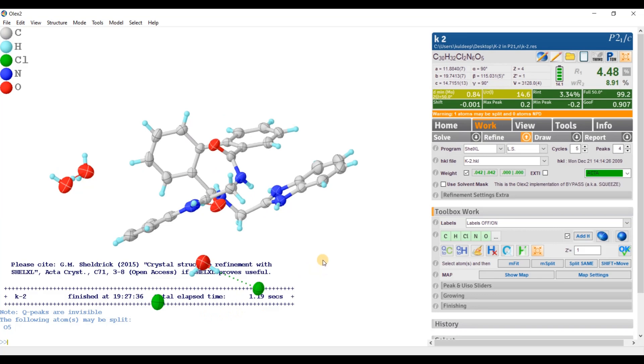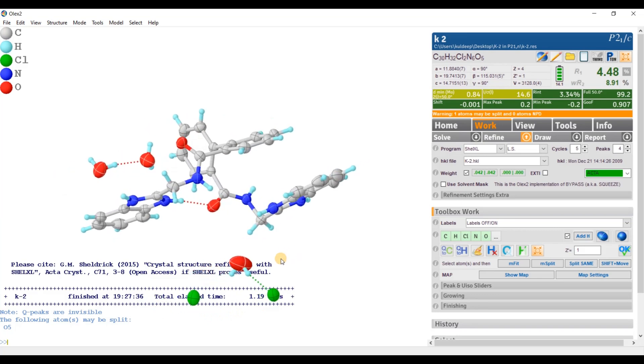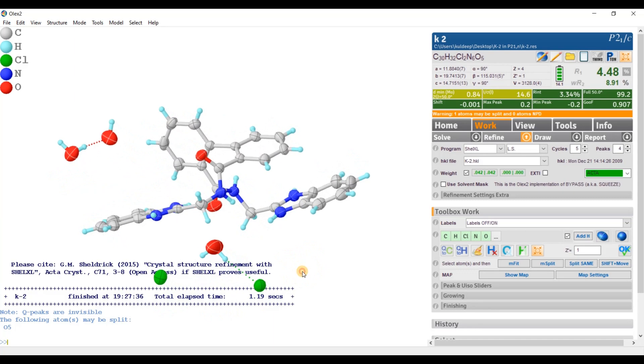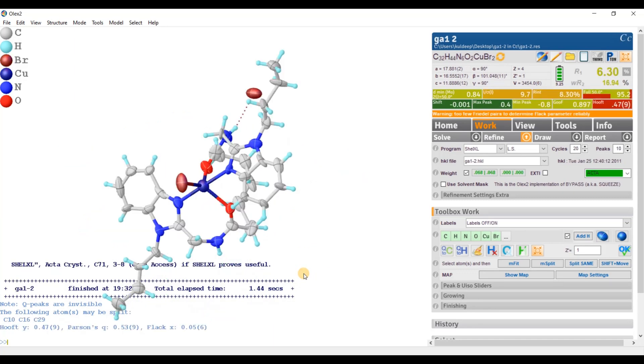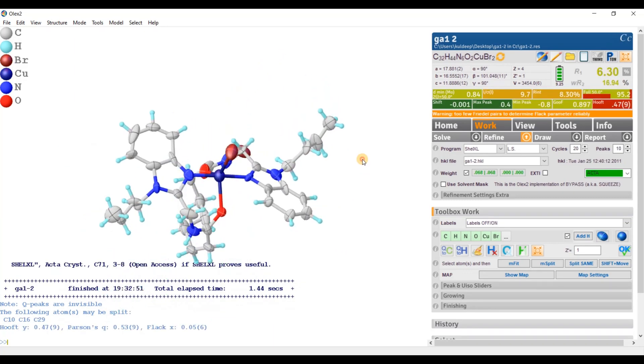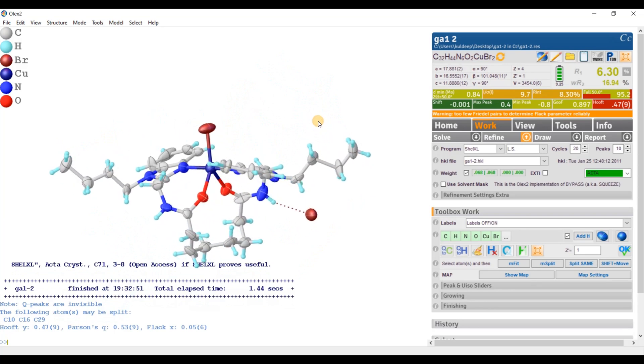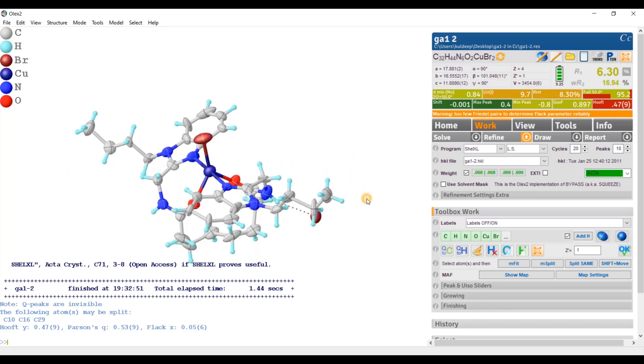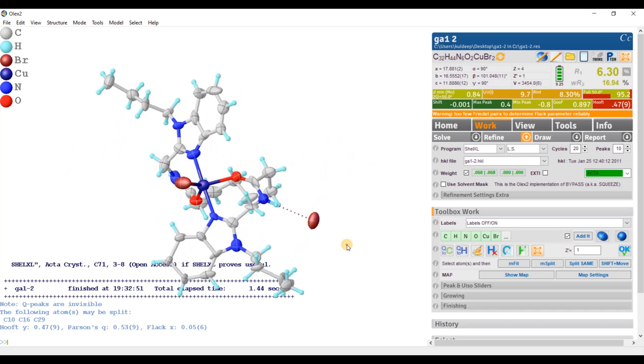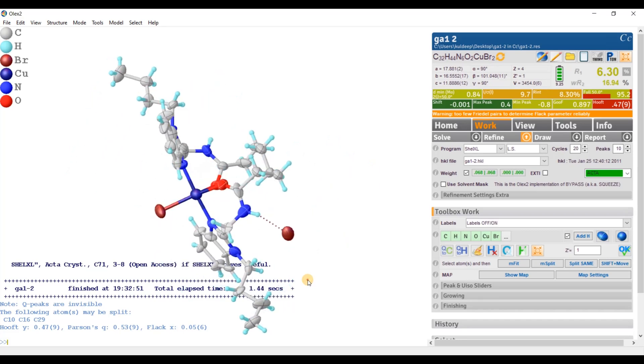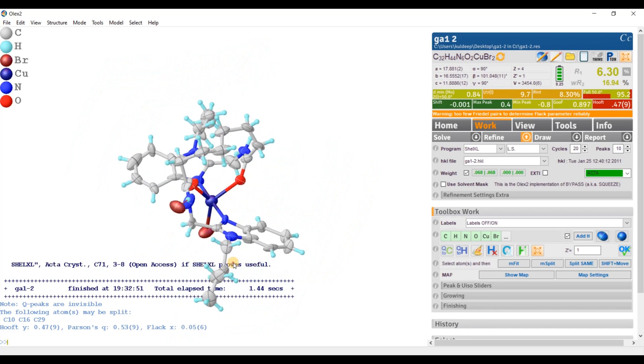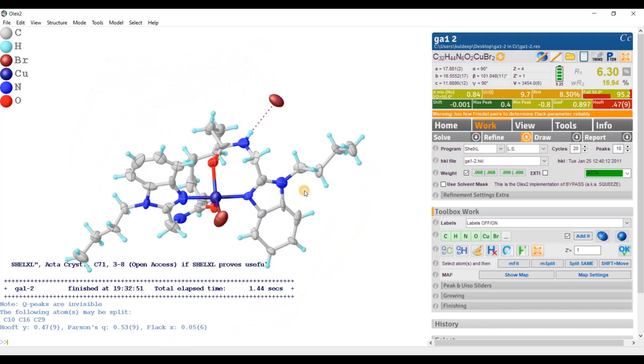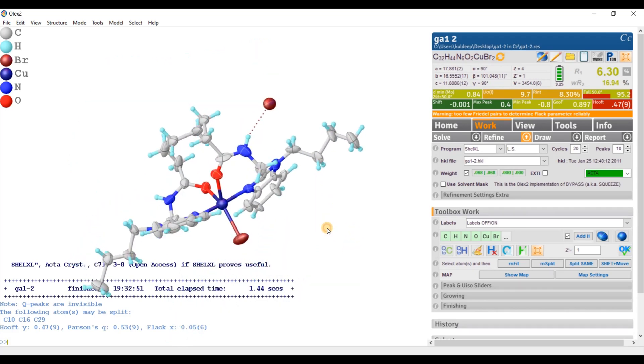Let's open this structure in Olex2. Okay. So this is another structure solved in space group CC. And this space group chosen by the integration software by default. And I solved this structure in space group CC.